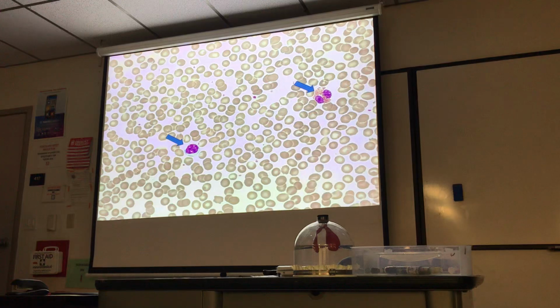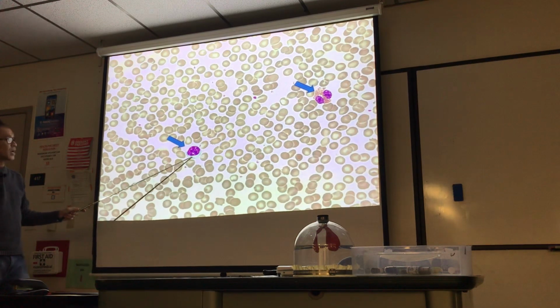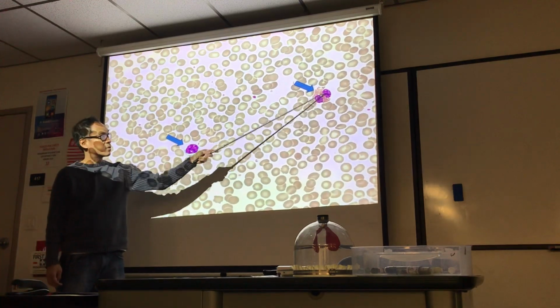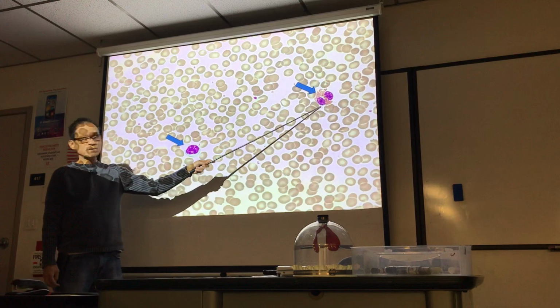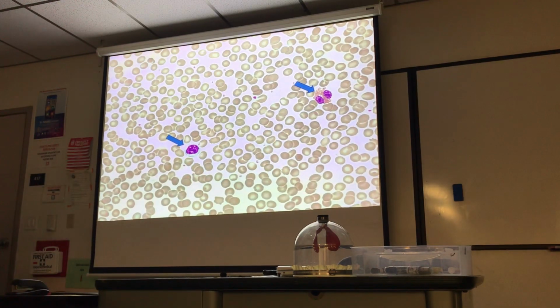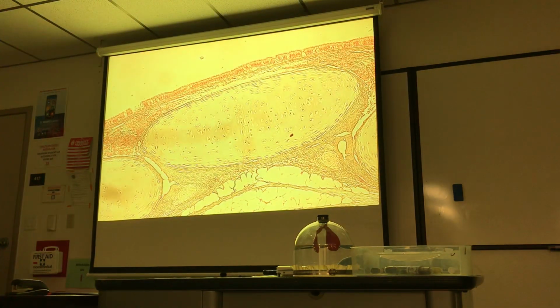Okay, back to identifying cells. Lymphocyte, nice large lymphocyte. I see the red granules again. I see the bilobed nature. Eosinophil. All right, so those are the blood cells I wanted you to identify, to bring it up to speed with the respiratory things.